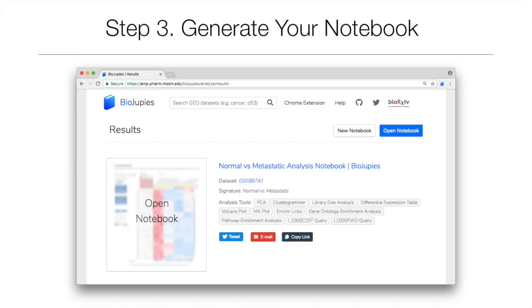Once the user has selected the desired tools, they can submit the notebook generation job, which typically takes between 15 seconds to a few minutes. Once completed, a link to a notebook is displayed on the website. Once generated, the notebook is permanently hosted online and can be accessed at any time in the future through the same URL.